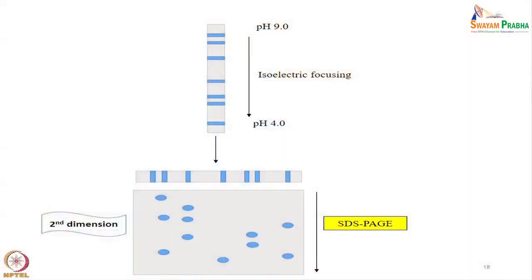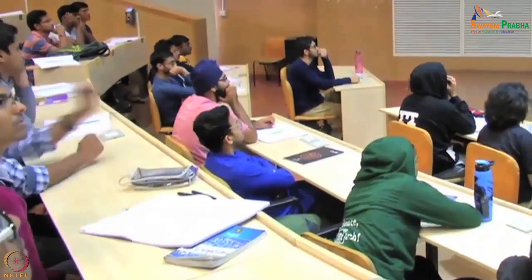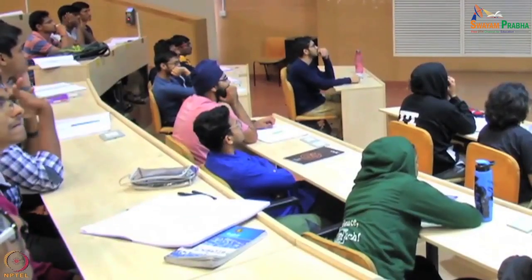So, the proteins we have separated based on their pI values are going to get further separated based on molecular weight. SDS-PAGE is one of the widely used electrophoretic techniques. It separates proteins according to their size. The detergent SDS, sodium dodecyl sulfate, is negatively charged.